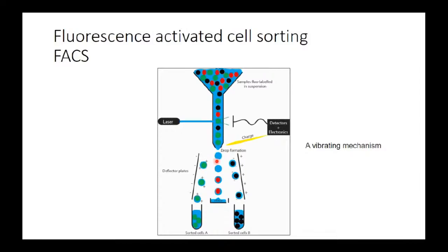This is very important. Then what I can do as a user is adjust the settings of the program in order to charge the cells. So at the end of the tube, I have something called the electrical charging ring. The electrical charging ring is responsible for charging the cells according to my adjustment.